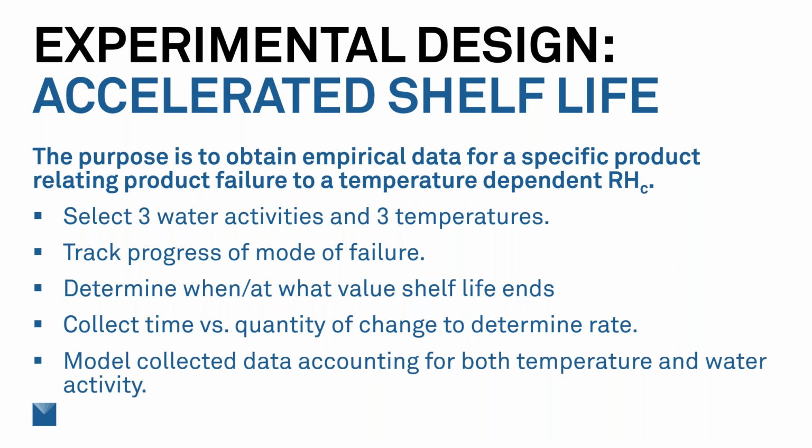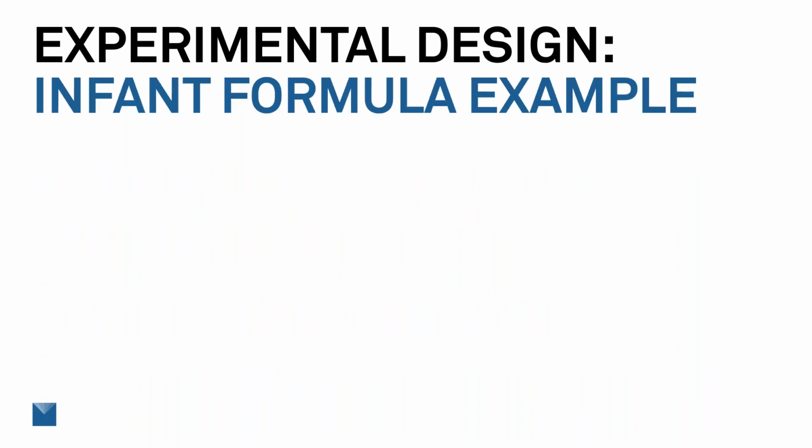And then after we're all done with that, we're going to model that collected data, accounting for time, temperature, and water activity. And when we get this correlation, we'll be able to model the shelf life and the reaction rates for your mode of failure.